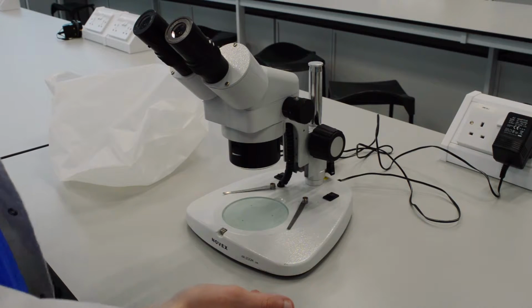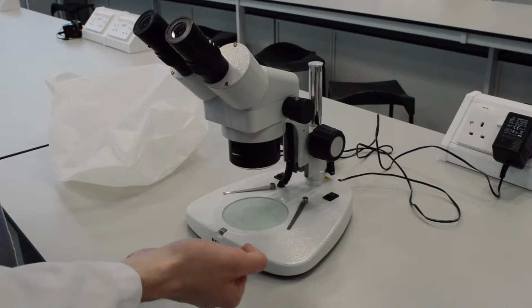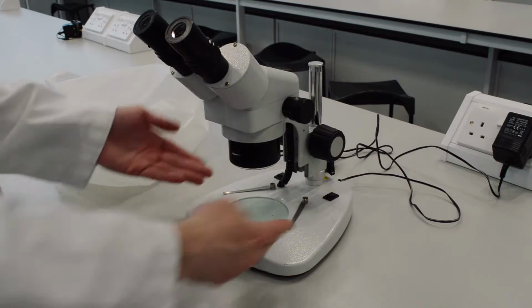Microscopes can be quite tricky to get your head around, so I'm going to show you how to use this white one now. So this is a dissection microscope. It's the microscope that you generally want to use in most situations. For example, when you're dissecting things or when you want to see an organism.